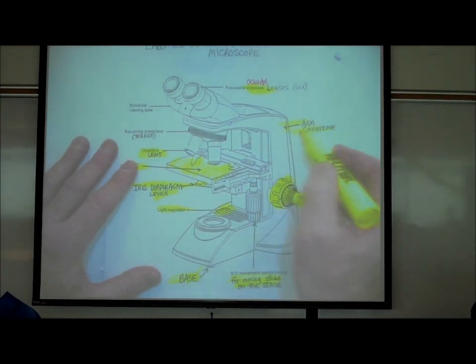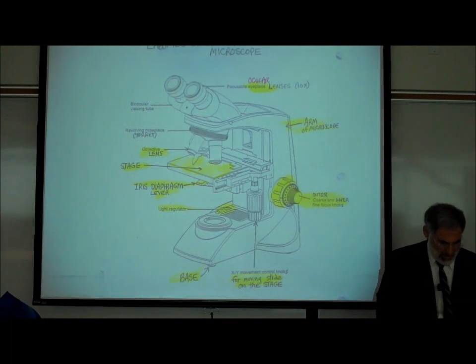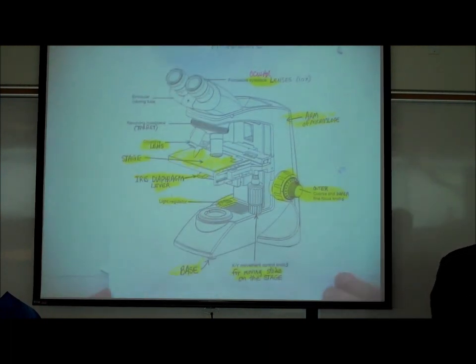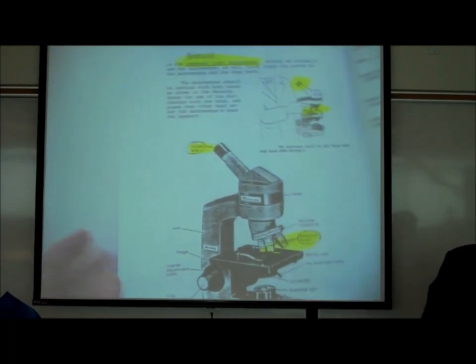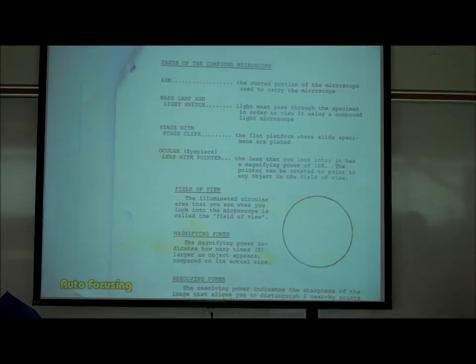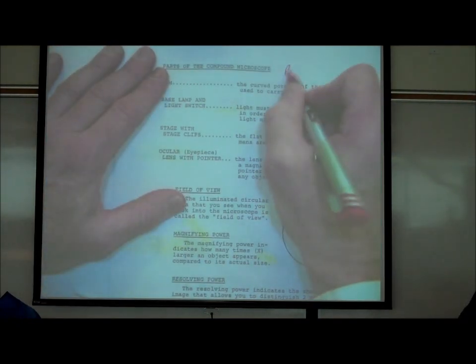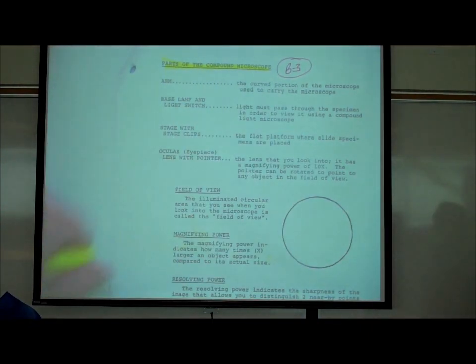This is called the arm of the microscope. So those are the parts of the microscope. Let's walk through this more specifically. On page B3 are the parts of the compound microscope.